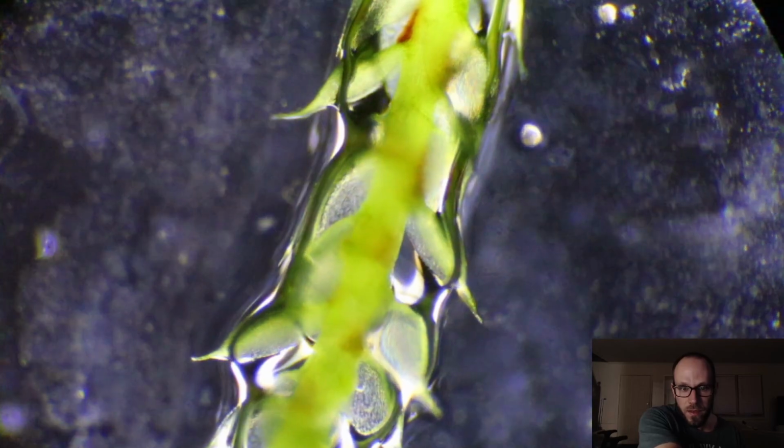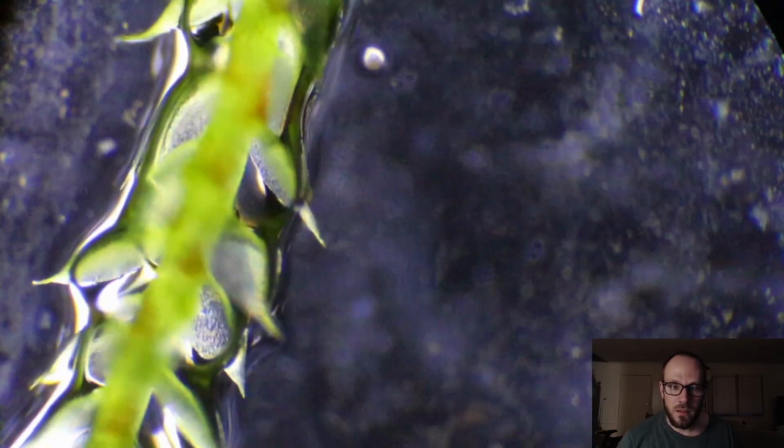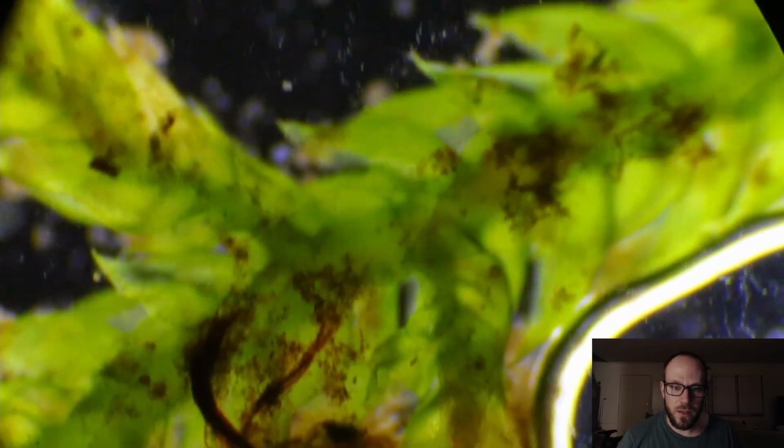I don't know. I'm hypothesizing here. I'm a lay person when it comes to this. Well, I don't think I'm quite as dumb as a lay person, I'm a little more knowledgeable, but I'm no scientist, that's for sure. You can see this goes outside of the slide. But yeah, I can do this for hours. I don't think this is the slide to which I was referring. I think I put them in the wrong order.